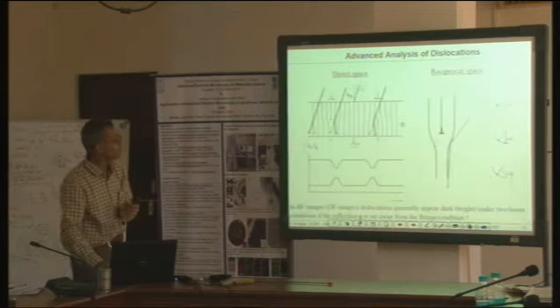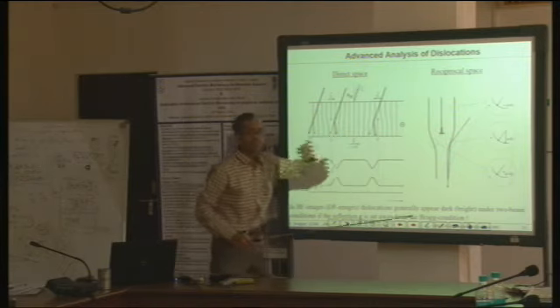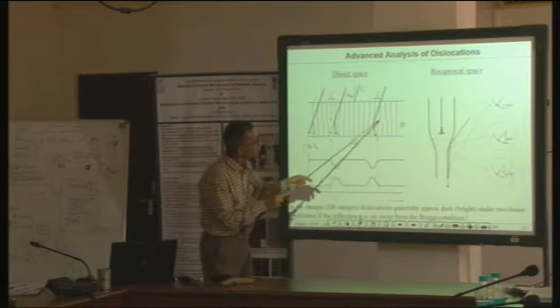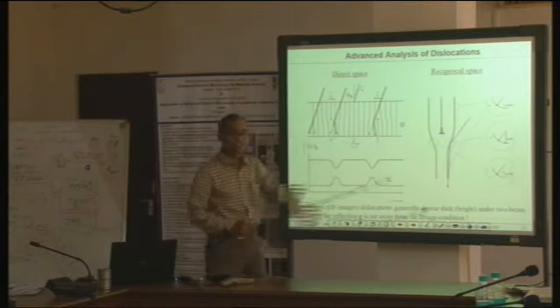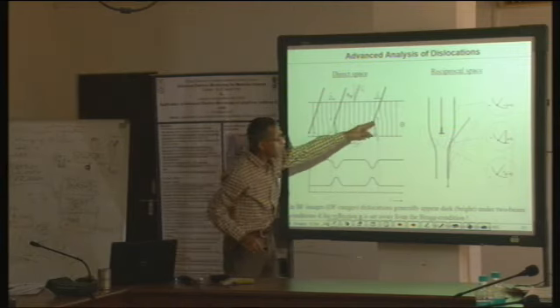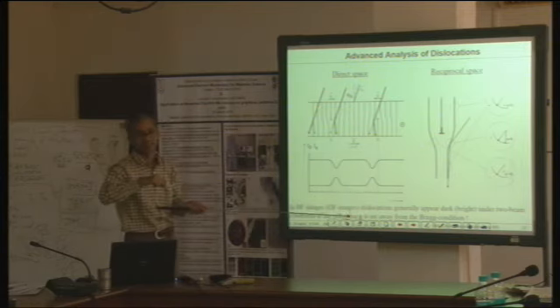Let's try to understand by this example. Let us consider this dislocation itself. If I am only slightly away from S equal to 0, then a larger portion around this core of the dislocation will be able to satisfy the Bragg diffraction condition. If my original S itself is too far away from the Bragg diffraction condition, only the maximum tilted portion around this core of the dislocation will bring the local material back into Bragg diffraction condition.